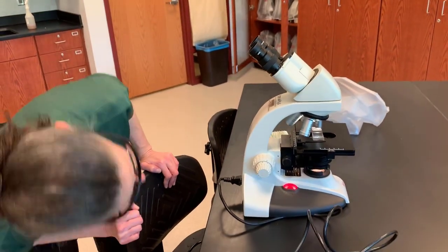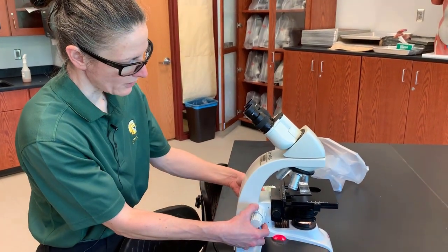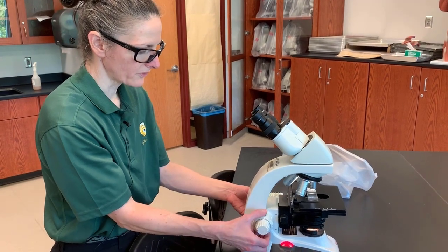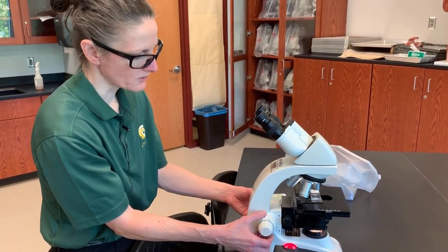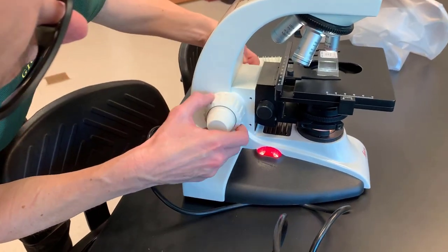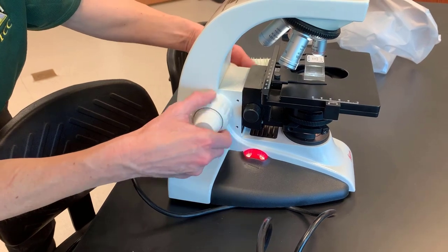Another thing we will see is we have our focus knobs. We have what's called a coarse focus knob and a fine focus knob — some people call these the coarse and fine adjustments. Either way, they basically will move the stage up and down, and that is what's going to help you focus the slide.